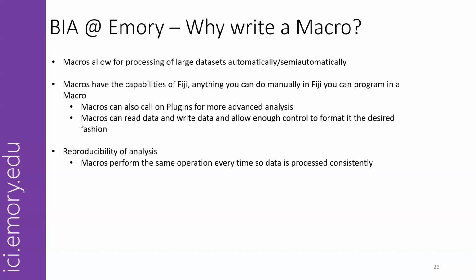But there is an upfront investment in time and effort when you write a macro, so it's not useful in every situation. Like if you're only going to create 10 of those Z stacks on this set of images, but you're never going to look at this data again once you have that, it doesn't make sense to write a macro to do 10 sets of calculations.